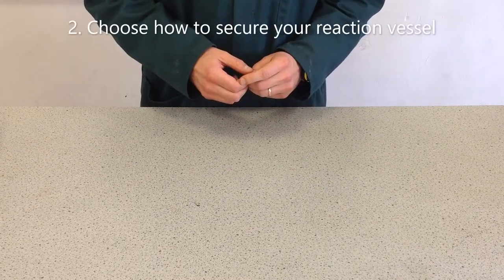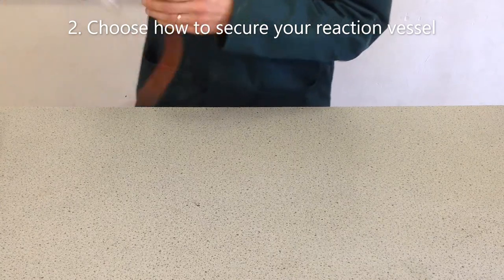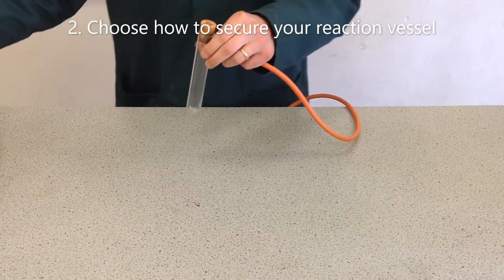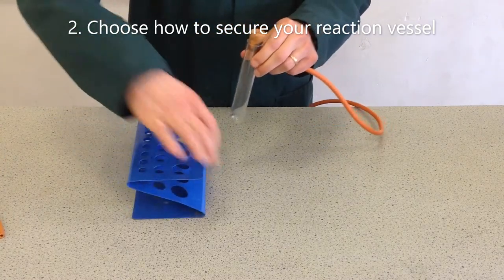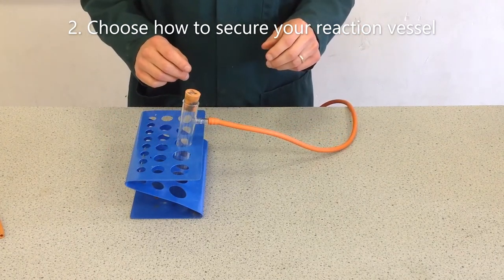Secondly, how will we secure the reaction vessel? There are two options. We can either use a clamp to clamp our vessel, or another useful alternative is to place it in a boiling tube rack.